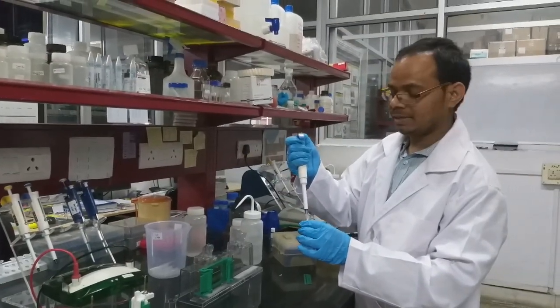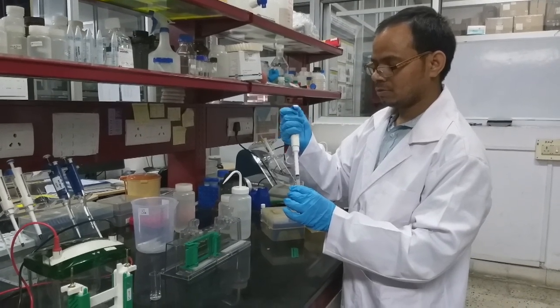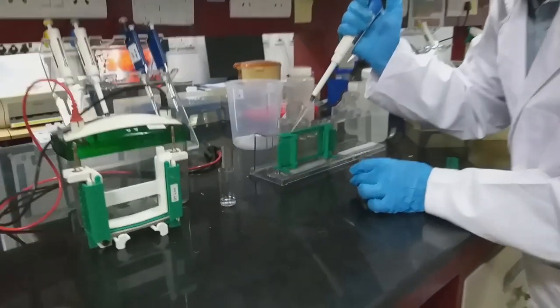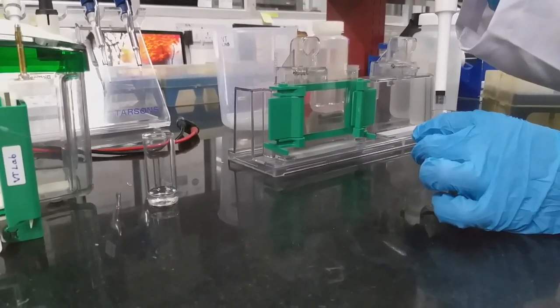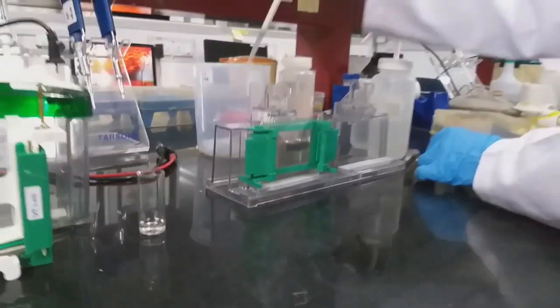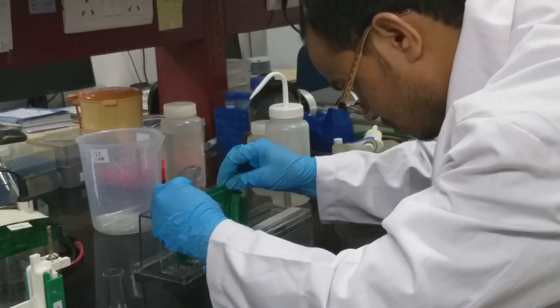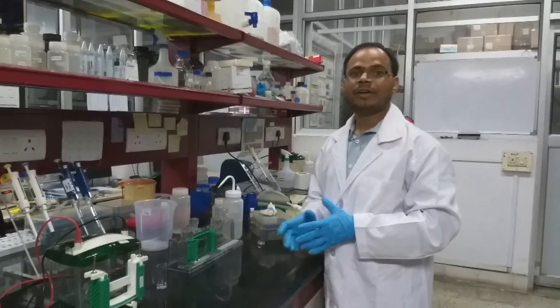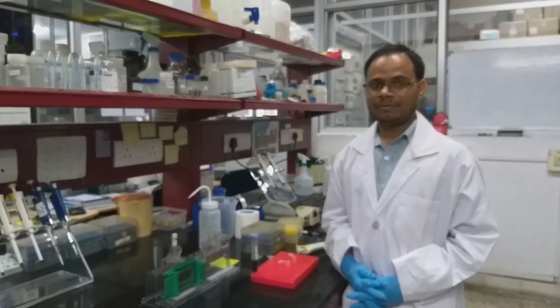We have to mix properly after adding the TEMED. Then you just add at one corner. Next we will keep it calm. Now we will wait until the gel gets solidified, then we will shift to the buffer tank and run the gel.